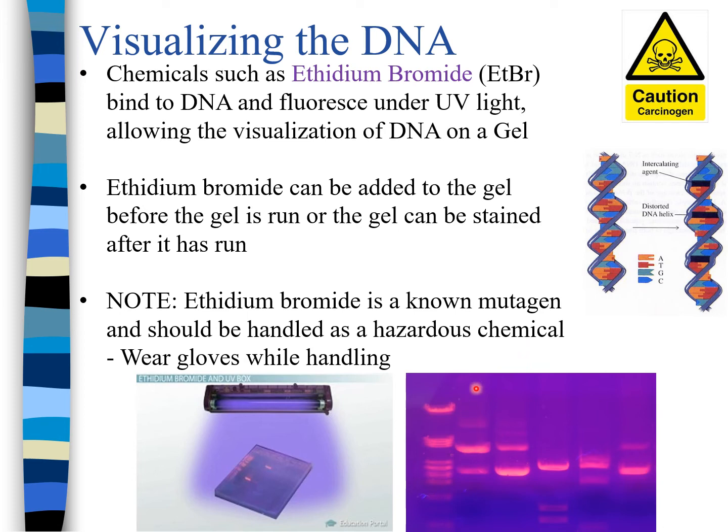This is patient 1, patient 2, for example, patient 3, patient 4, patient 5. The first sample here is a DNA marker. I'll talk more about it, what the DNA marker is and how to read this photograph.